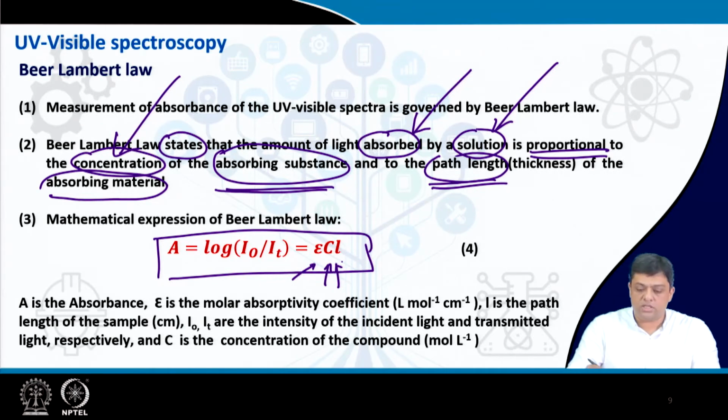So, this is the mathematical expression of the Beer-Lambert law.